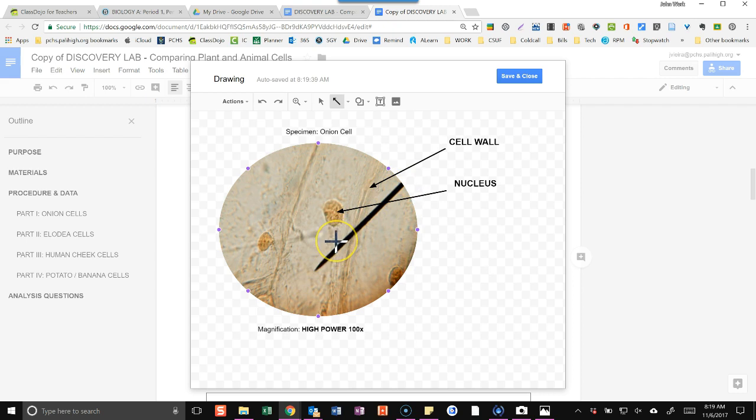That needle is built into the microscope to show you where you're zooming in. At the very tip of the needle, if you go from low to medium, it's going to zoom in right here. If you go from medium to high, it's going to zoom in right there. So place the needle wherever you want to zoom in.